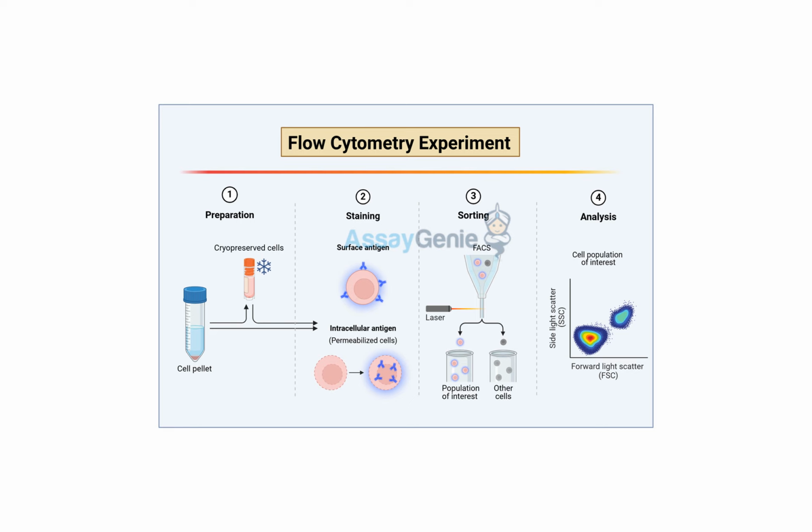Absolutely. But studying them inside the cell sounds tricky. It can be challenging. Why is that? Well, because they're often expressed very transiently. Transiently? It means they kind of appear and disappear quickly. Oh, so like trying to catch a fleeting thought. Exactly. And on top of that, they're really small, and they could easily leak out of the cell, especially during permeabilization, when we're poking those little holes. So it's not as simple as just adding antibodies and seeing what happens. No, it requires some specialized techniques to make sure we preserve those cytokines so they don't escape. Got it. Now, what about phosphoprotein analysis?